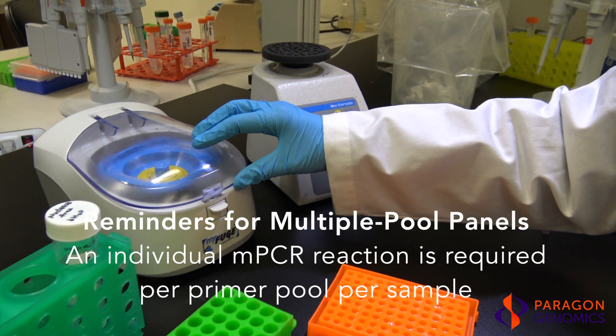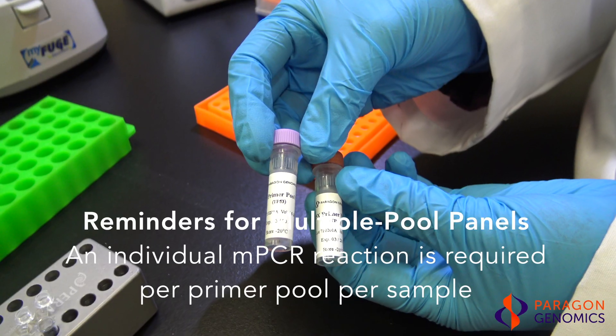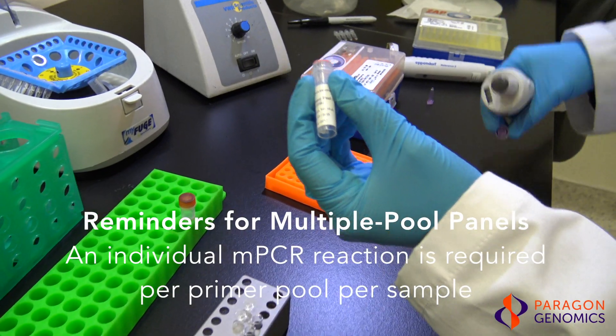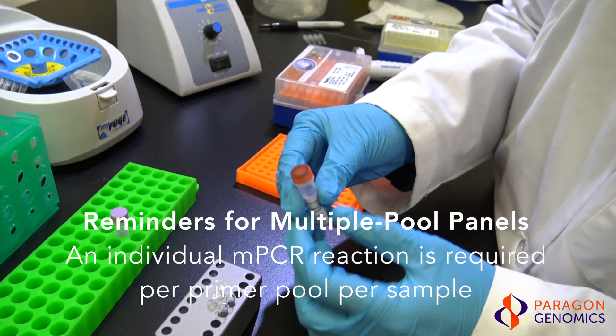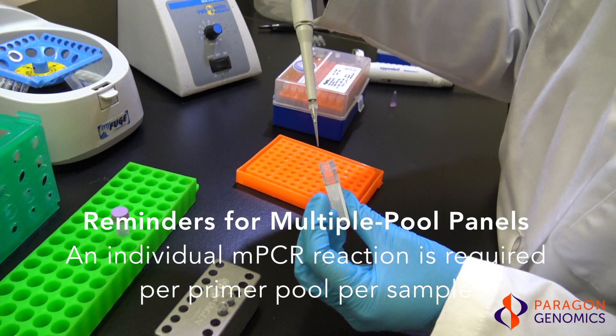We will end this video by providing some reminders for CleanPlex NGS panels containing multiple pools of primers. For two pool panels such as the CleanPlex TP53 panel, two separate multiplex PCR reactions are required for each sample — one reaction for each pool of the multiplex PCR primers.